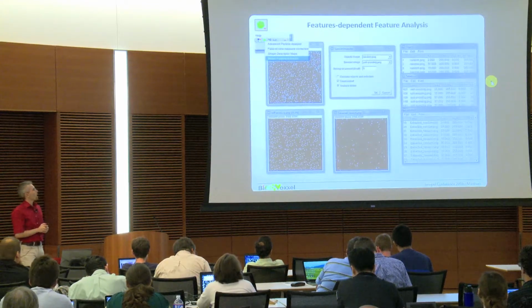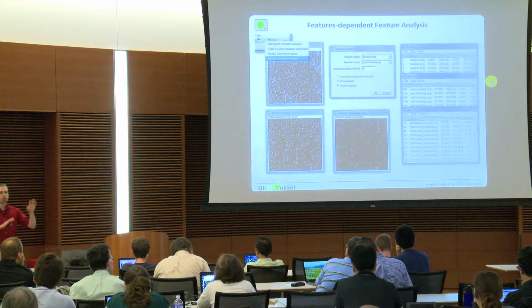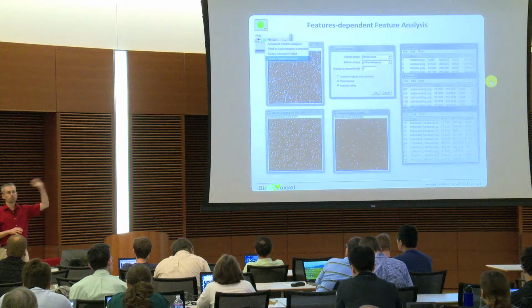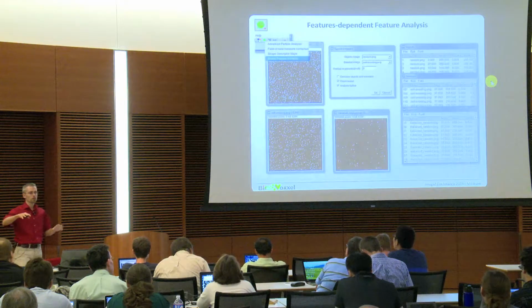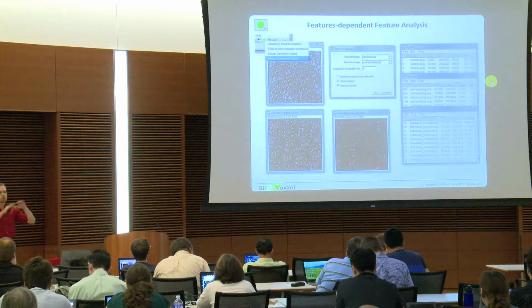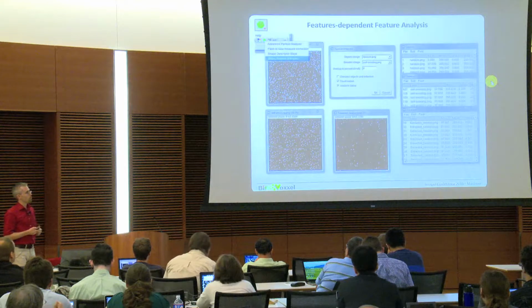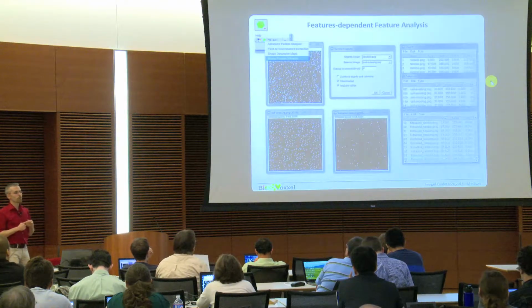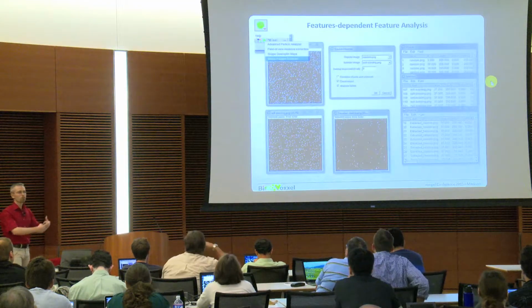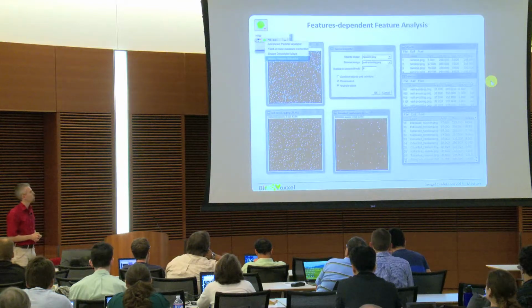First of all, what we have as an option here is, sometimes you might have two things. You might have an image with fluorescent markers, for example marker A and marker B, and you want to see, similar to a co-localization, where there is some kind of overlap. That would be a purpose for the following. Or if you want to extract specific objects from the image and work only further with those if they coincide with an object in a second image.